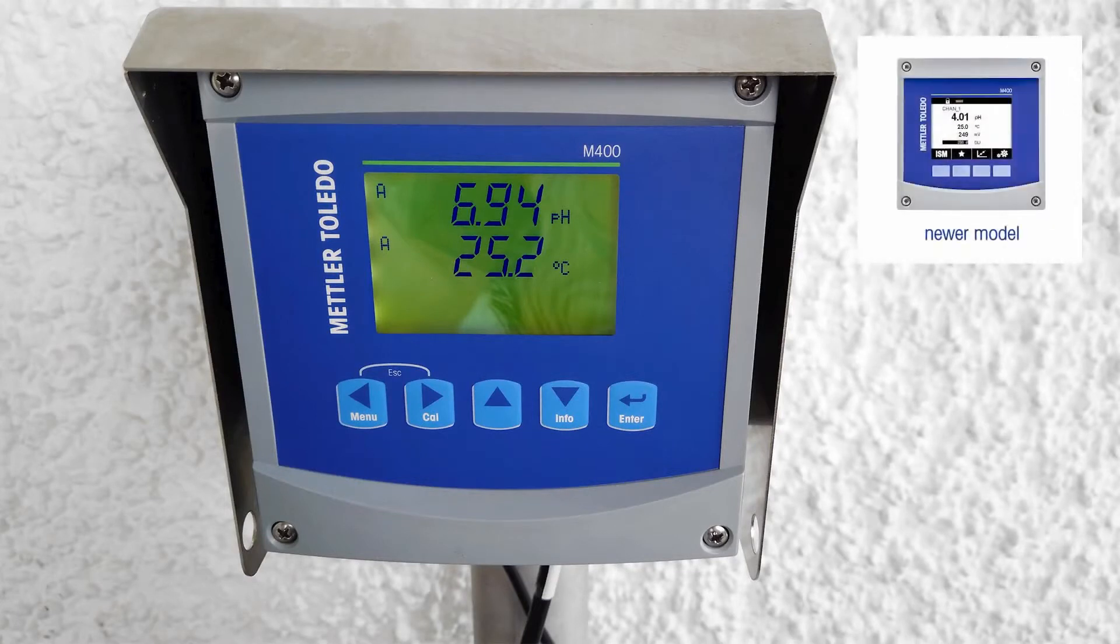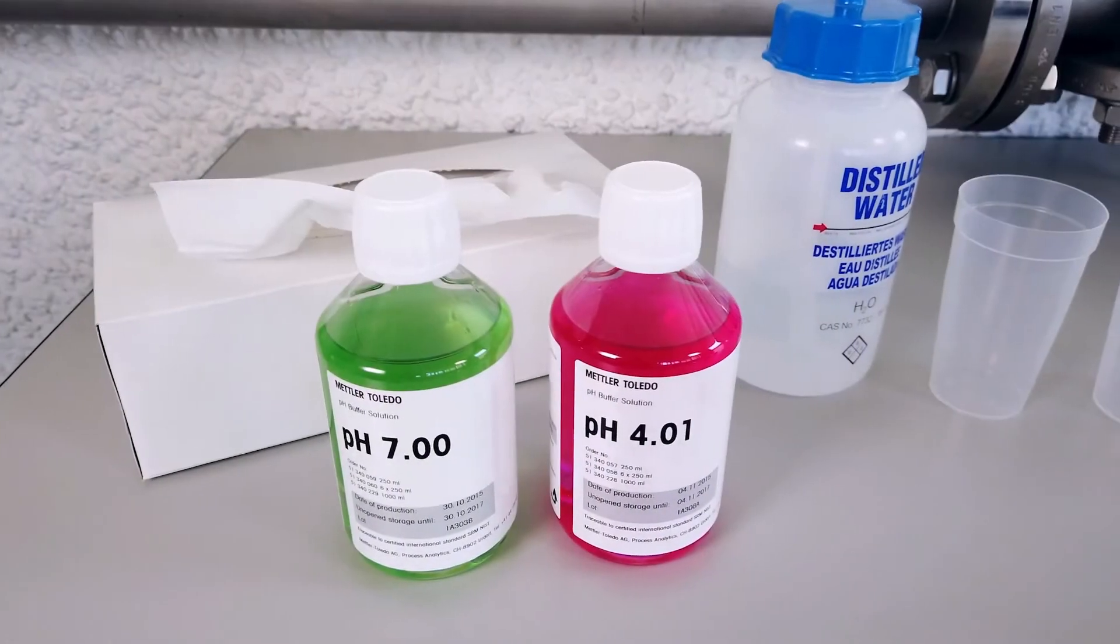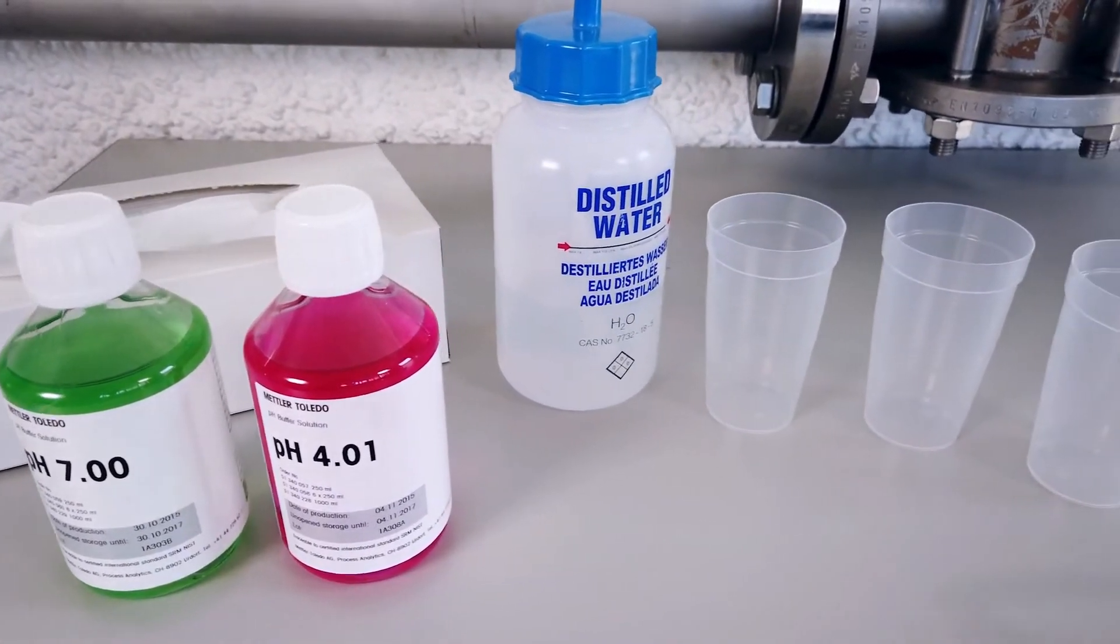If yours looks different, please find our calibration video on the next generation of M400. For a two-point calibration, use pH 4 and pH 7 buffers.